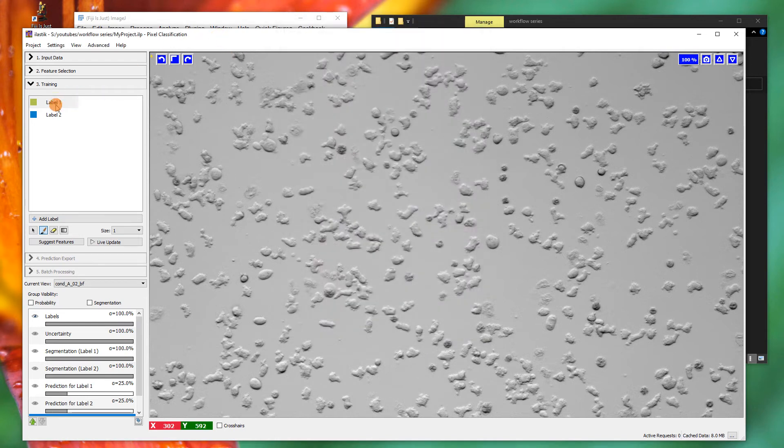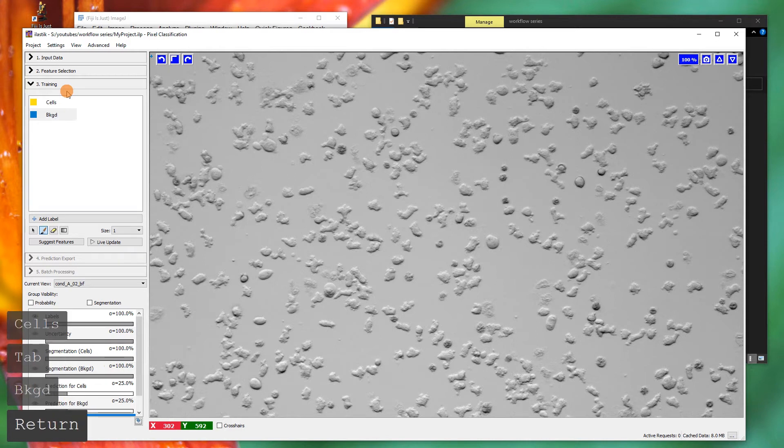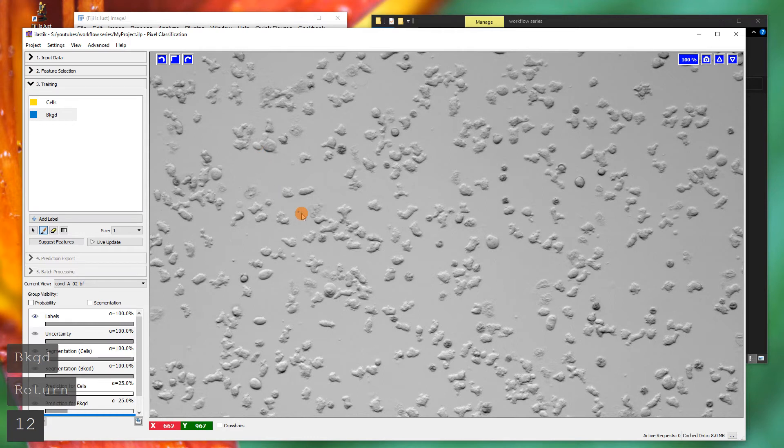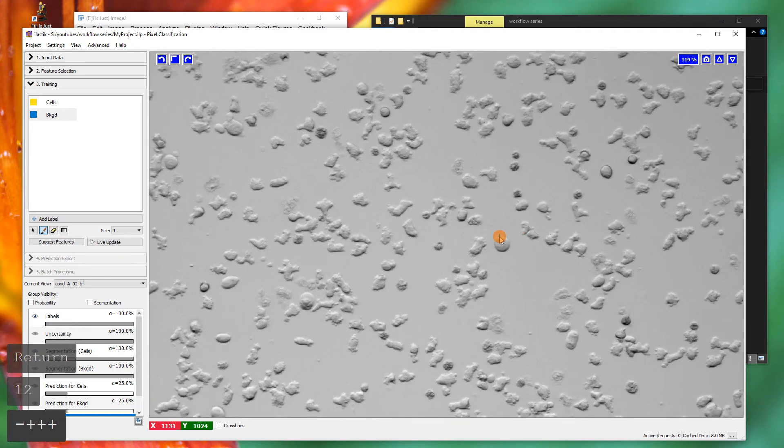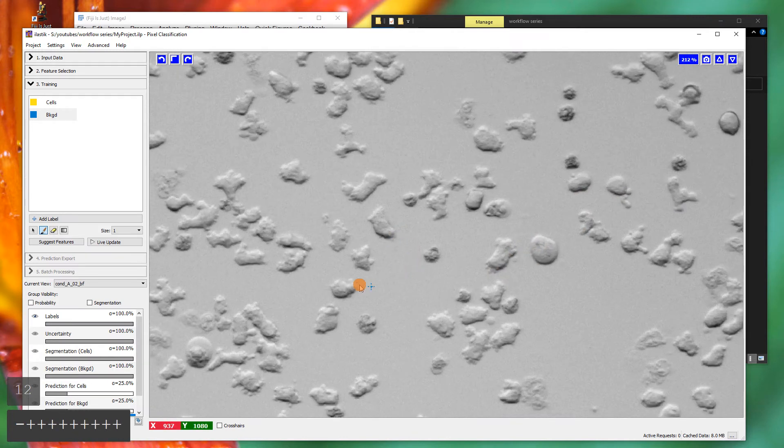The first thing we need to do is double-click on these and label our different options. We've got label cells, then we've got label background. Keep things short. We'll use that. Then we can go around and label them with these two. We're going to use our one and two shortcut keys to go there, and we've got the zoom in and zoom out with plus and minus.